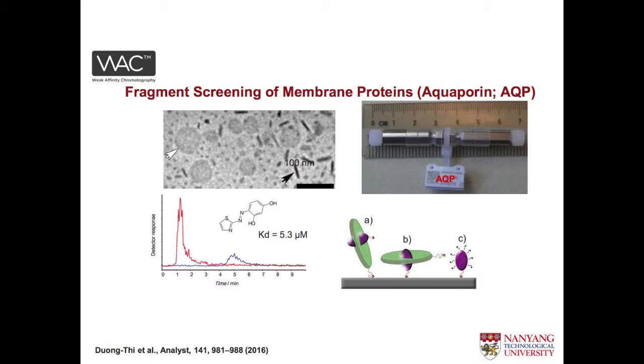Here is one work we did on aquaporin, which is a membrane protein. We were able to integrate this in discs, you can see the discs here, and apply that and immobilize it onto a column. Then we ran a small library of 200 substances, I think, and found at least one good fragment that was binding at around 5 micromolar.